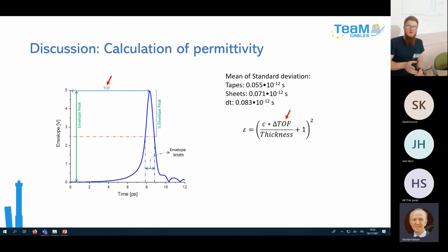The cables we did not. For the cables, we just had these two measurement points because there is another issue coming there. If we're talking about cables, right? They are bent. They are not perfectly straight. So you have a bit of an issue there because first we need to have exactly the same distance to the sample over the whole scanning process.